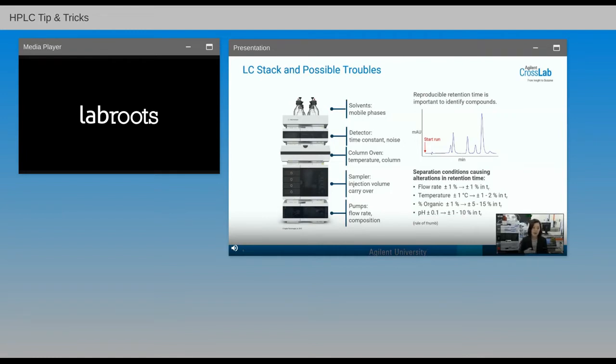Why the pump may be at the lower part? It could be because the pump is very heavy. So it really depends on the lab situations and the lab conditions. But in this example here, still the pump is at the lowest because it's heavier.